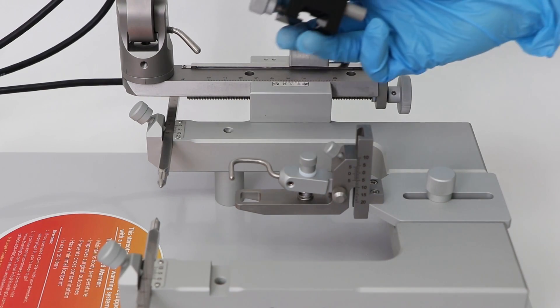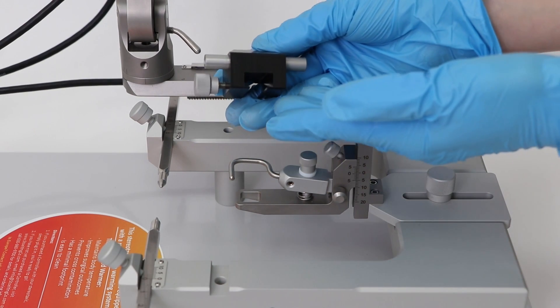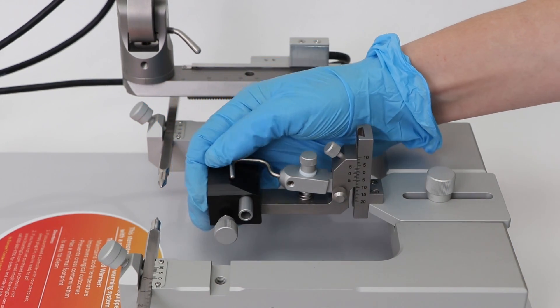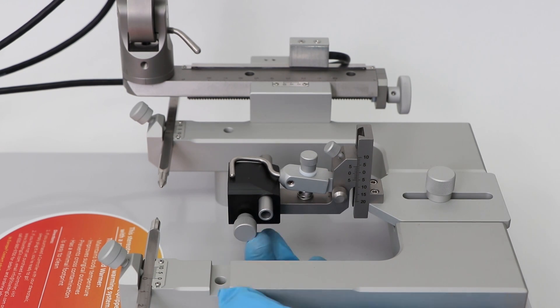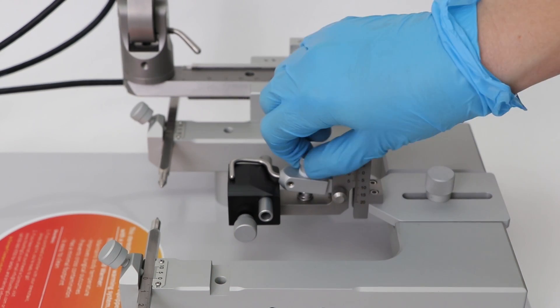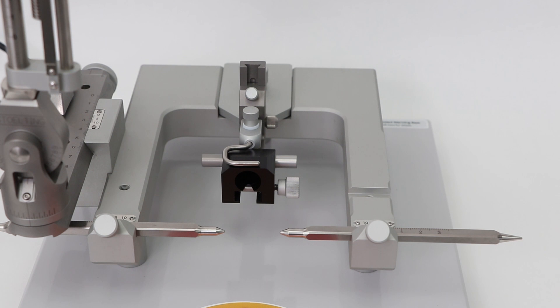Attach the rat anesthesia mask onto the nosecone clamp. Make sure it is fitted securely using the fastening screw. Connect your anesthesia system of choice to the connection port seated at the back of the mask block.